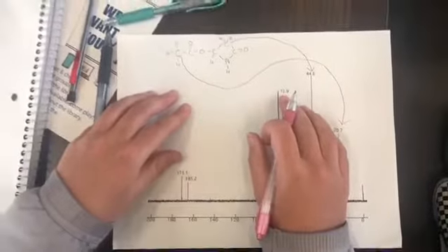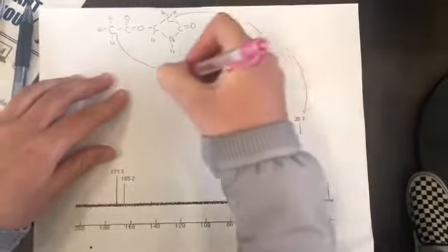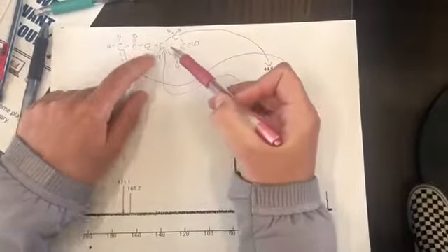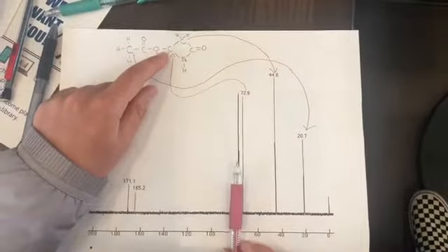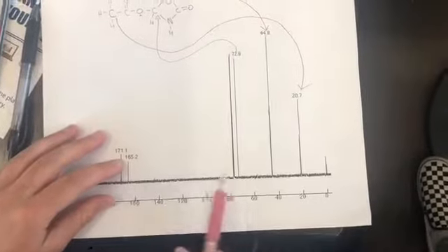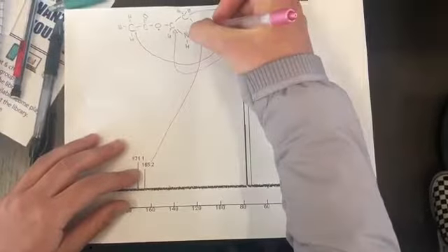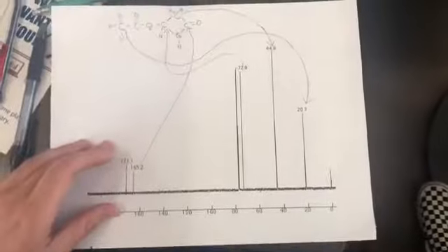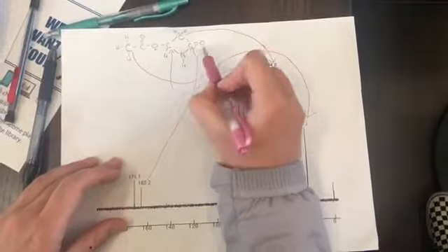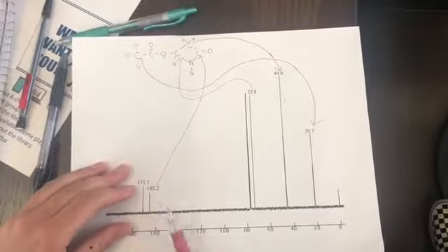And so then 72 is the next position. And that one is going to belong to this carbon, which is also a part of the ring and is attached to one oxygen. So it's going to be slightly more shifted downfield due to that oxygen pulling its electrons. And so then a really far shift down to 165 is going to bring you to this ketone right here. So this carbon is obviously electronegative because it's attached to the nitrogen and the oxygen, and it's part of a ring. So it's going to cause a really big downfield shift due to that electronegativity.